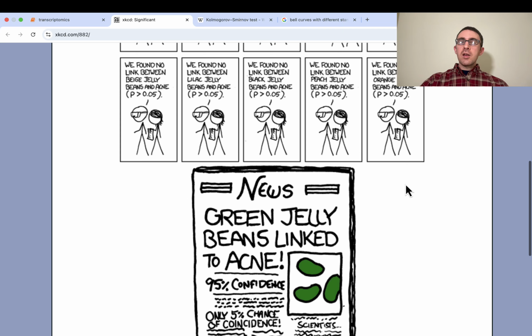So just to remind you guys what the point of all of this is, like I was showing you before on the slides. The point is that we have, for every gene, basically, an observed distribution of expression measurements in both the IPF and control conditions. And the goal of a differential expression analysis is to look for genes where there's an interesting difference between the observed expression distributions in the two conditions, basically.